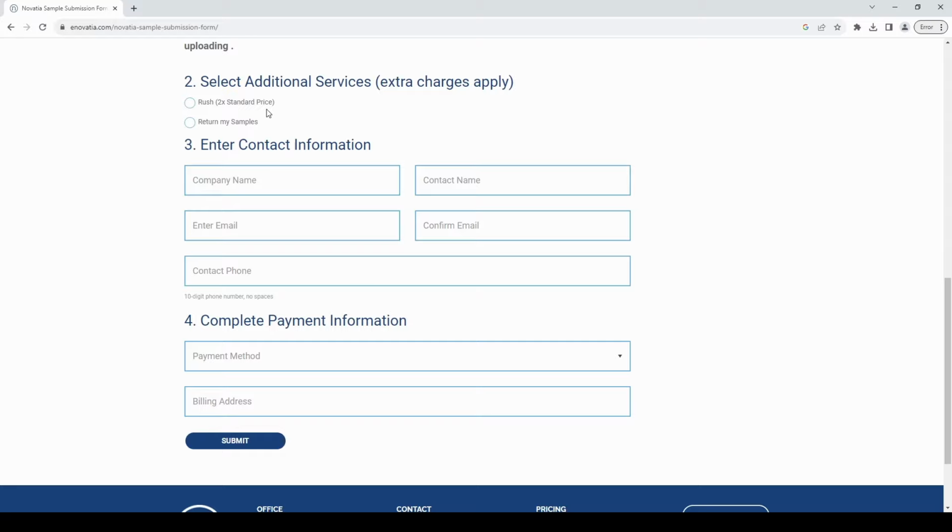Selecting rush in the sample submission sheet and providing it on this page will move your sample to the front of the workflow, ensuring that your submission gets priority treatment, but this does not always guarantee faster return of ProMass results. We'll try our best to return results promptly, but factors that may impact return time depend on our workflow, current instrument usage, time of arrival of these samples, MS method requested, and your amount of rush samples.